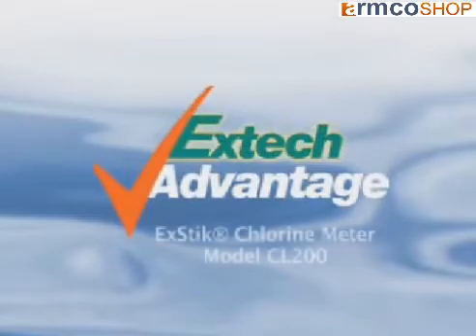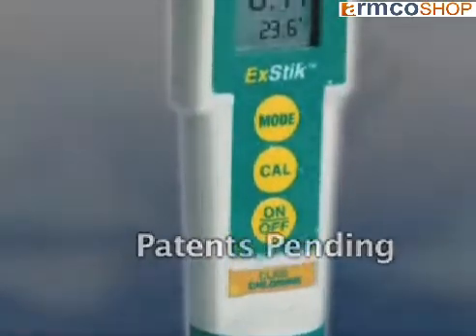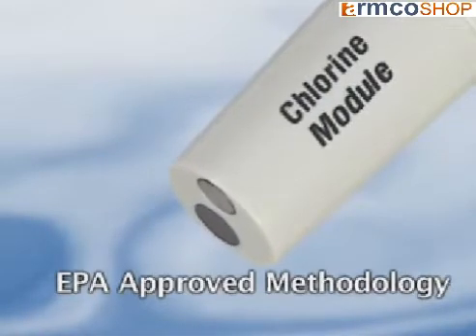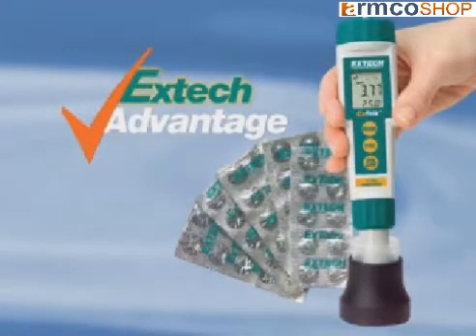Explore the new technique of measuring total residual chlorine using an EXTEC chlorine meter. The EXTEC chlorine meter utilizes an EPA-approved methodology, using a flat surface ion-selective electrode to detect the total residual chlorine in a liquid sample. Here are the EXTEC advantages you will gain by using this new method to measure your chlorine samples.